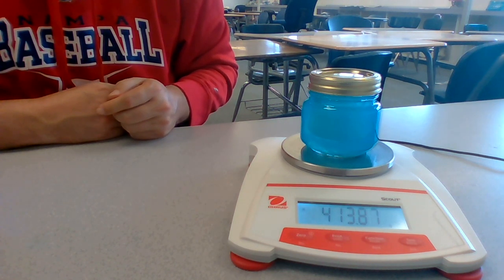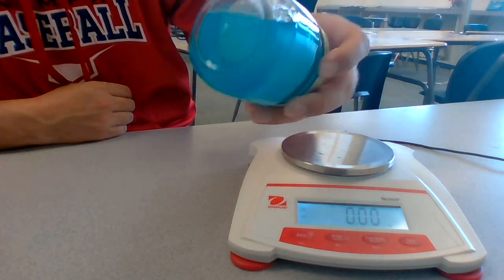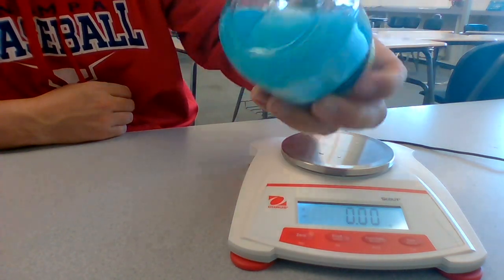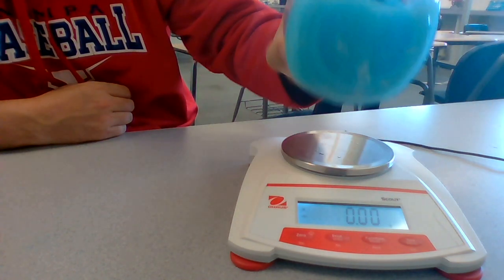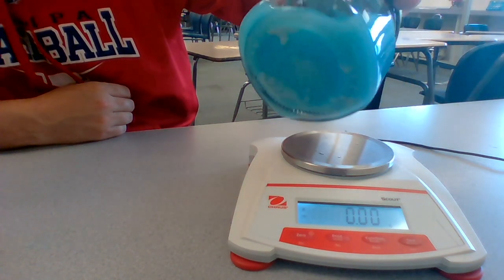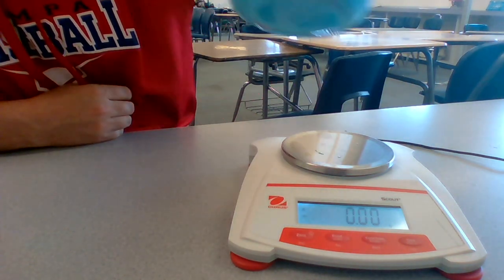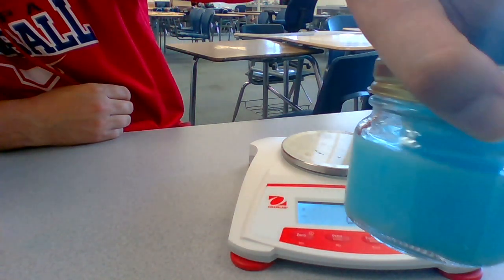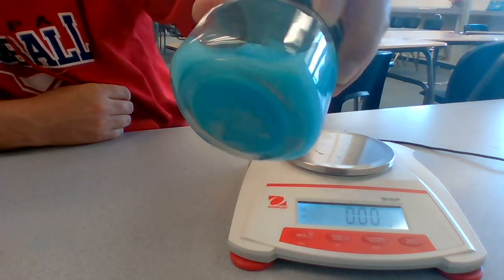Now I'm going to tip this over, and we're going to observe what happens. So the silver nitrate has now gone into the copper chloride, and I want you to record your observations of what happened here. I'm going to dump all this — look at all that there. Awesome.